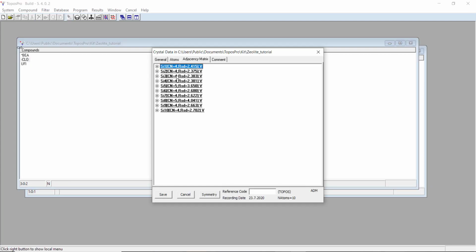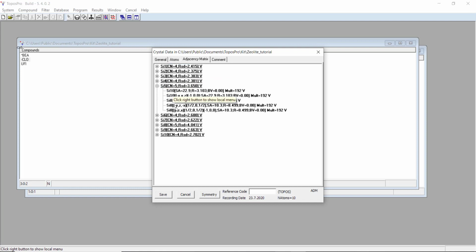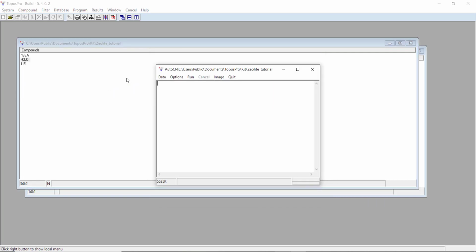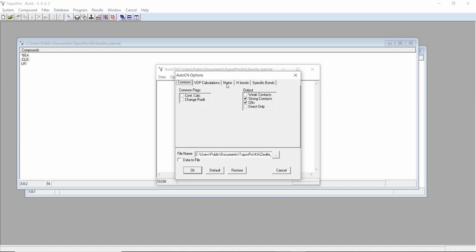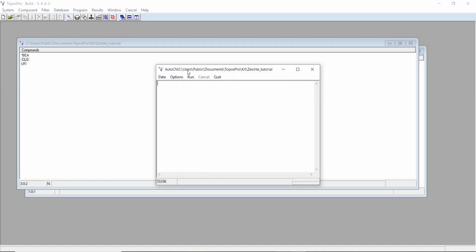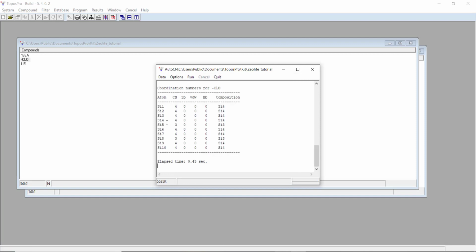So if we study the adjacency matrix, go to the one that's coordinated to 5. We have 2 bond lengths here that are 8.5 angstroms, compared to the other bonds between silicons, which is about 3 angstroms. So we know that these 2 bonds are probably incorrect. To get around this, we simply just need to increase the minimum omega value. So we'll just change that to, say, 15, for example. Press run. Now those coordinations have reduced down to 3.